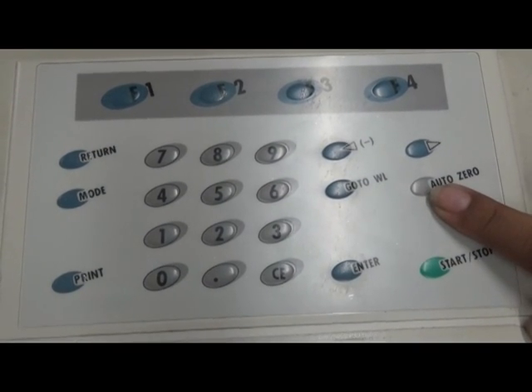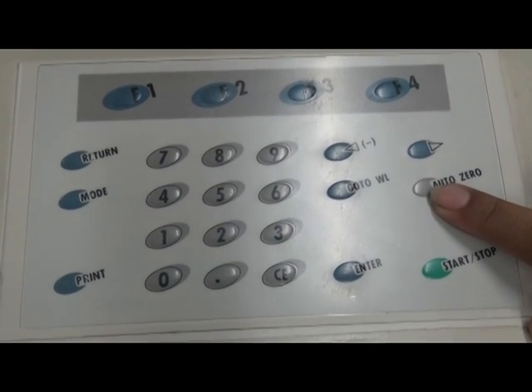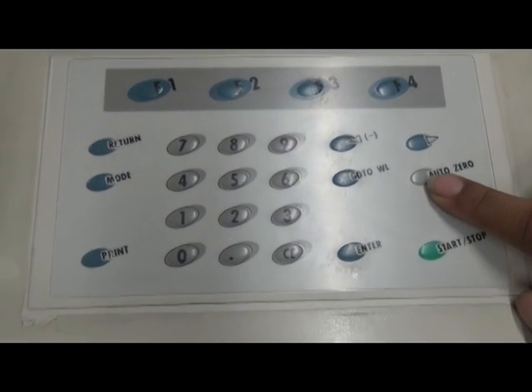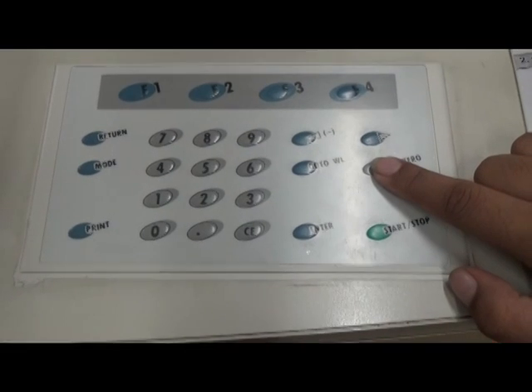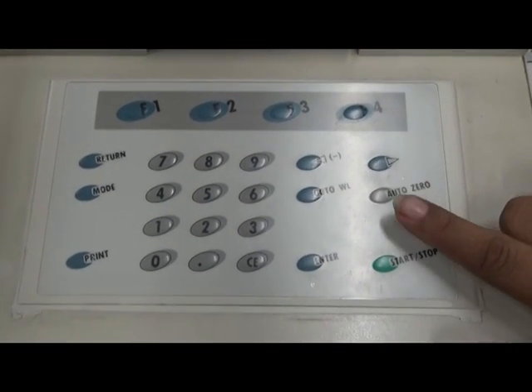This is called the auto zero key. When you press this key, the current wavelength will automatically be set to zero absorption, that is 100% transmittance. Make sure that prior to the sample measurement, a blank cuvette is placed in both the sample and reference sites.